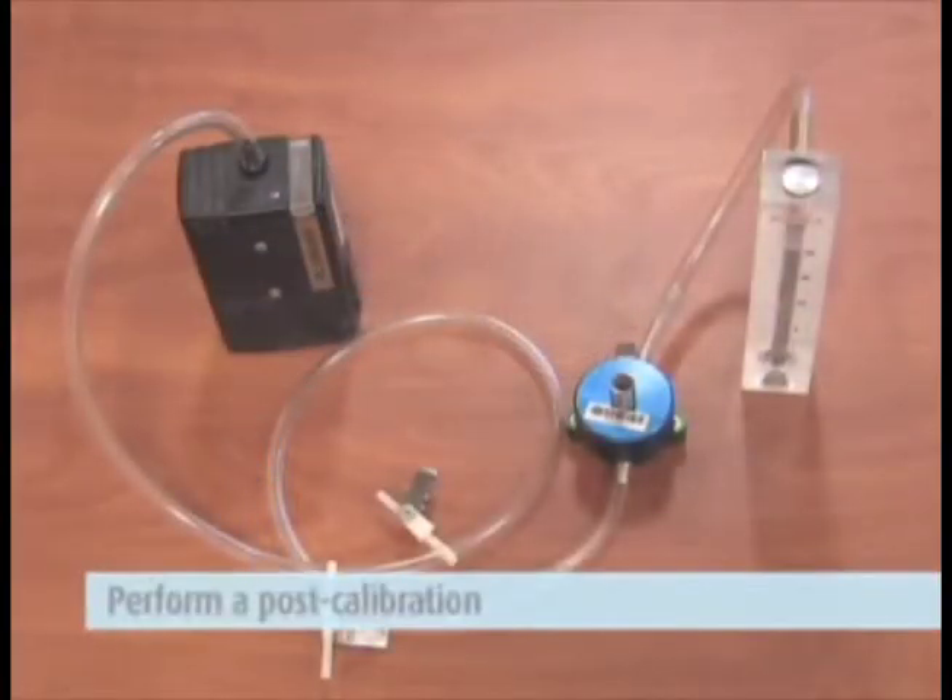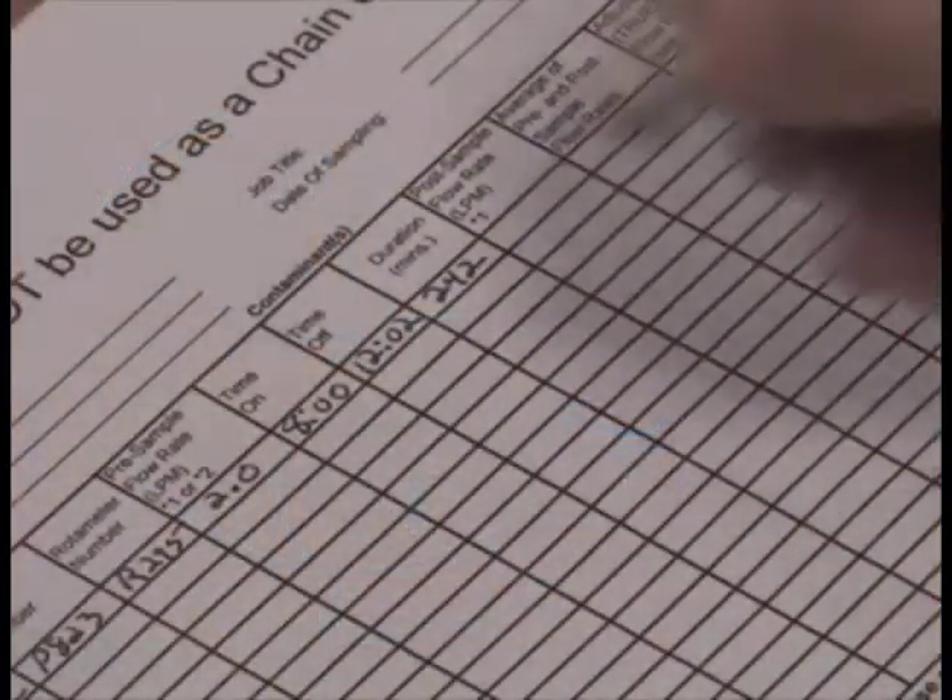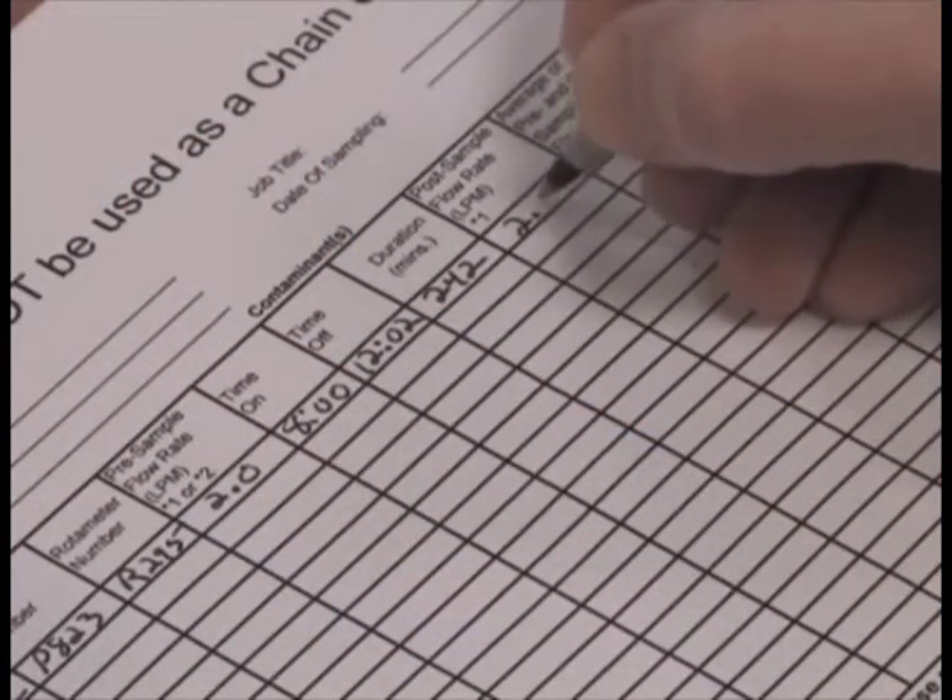Now, perform a post-calibration, preferably in the same area you did the pre-calibration. Then record the flow rate on the pump calibration sheet.